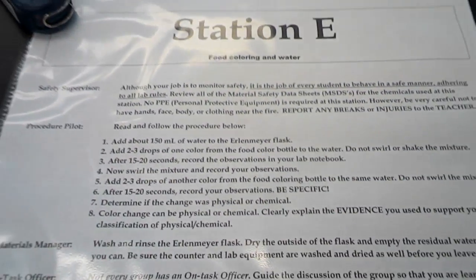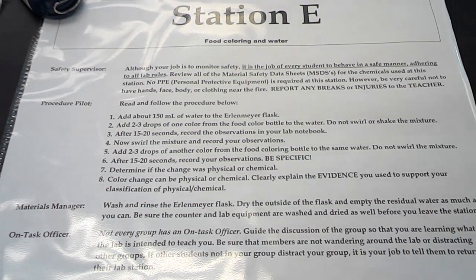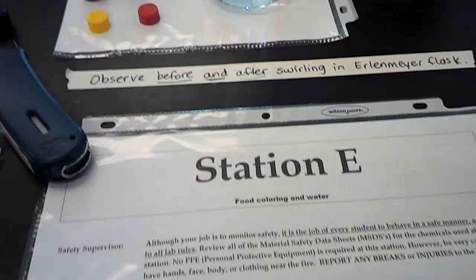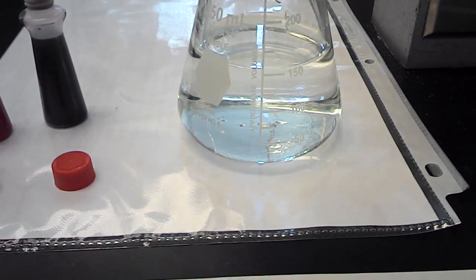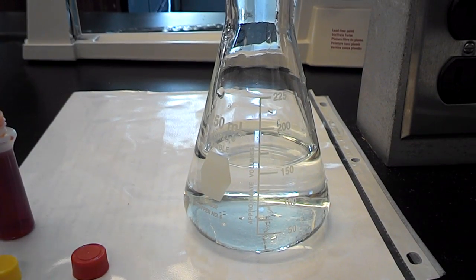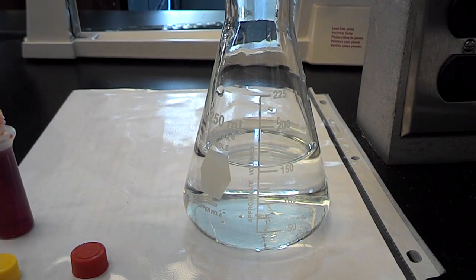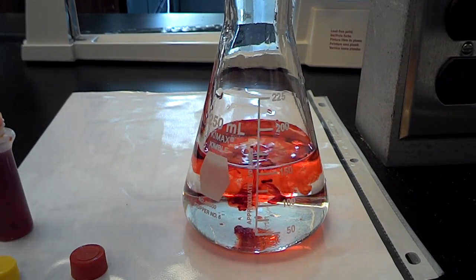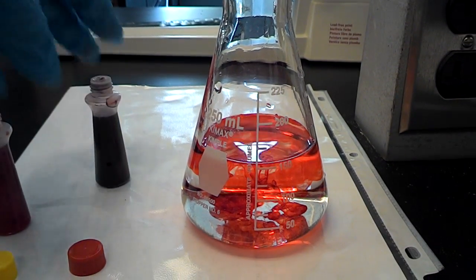Station E is food coloring in water. No PPE is required here. You have about 150 milliliters of water in the Erlenmeyer flask. And then you're going to add a couple of drops of one food coloring. In this case, I'm using red. First, you're going to observe it before you swirl.